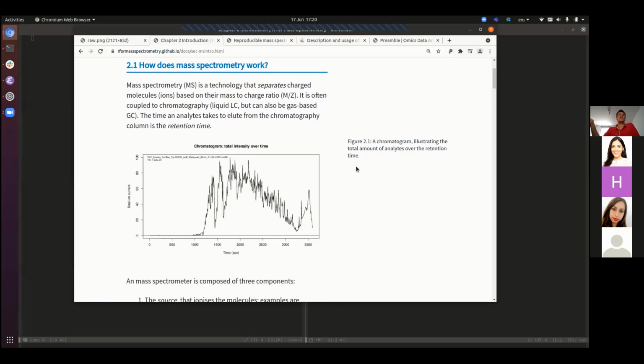Each of these different types of data will have their specific properties. And I really believe that it's important to understand where the data comes from, what the data looks like, to be able to make informed decisions when it comes to its analysis and its understanding.